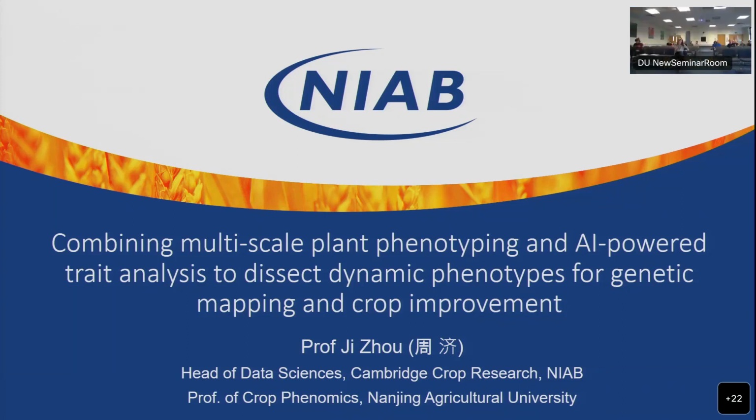My talk has been divided in two parts. One part is to demonstrate the capability from our side, what we can do in multi-scale plant phenotyping and crop phenotyping, not only in the greenhouse but also in the field. And the second part is about trait analysis. How can we get traits from large-scale imaging, and how can these imaging-based data feed into trait analysis and eventually lead to genetic mapping and also gene discovery.